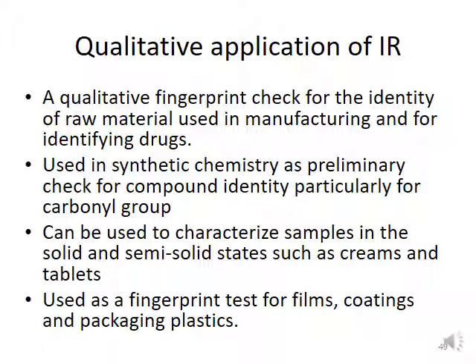And after that, next is using the fingerprint test for films, coatings, and packaging plastic. Basically, certain companies which produce film, coatings, or packaging plastics will require this kind of instrument just to check whether it is the same compound or not.